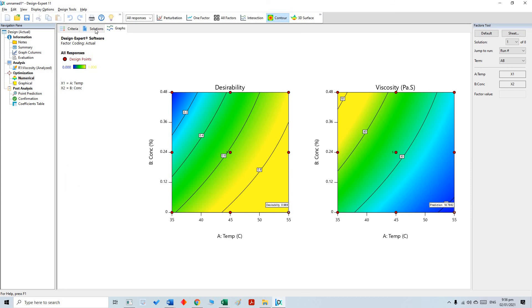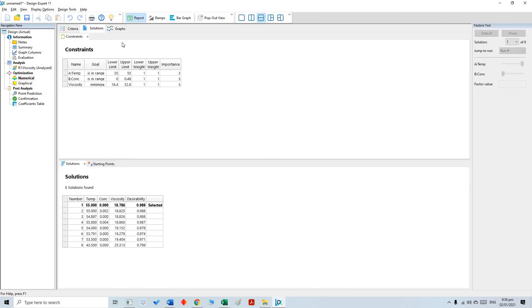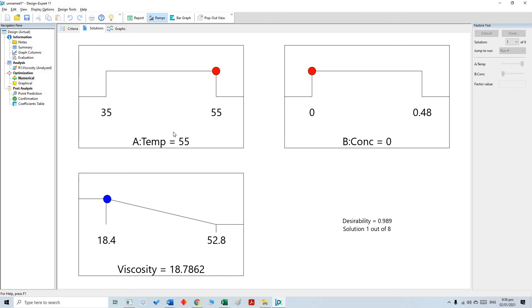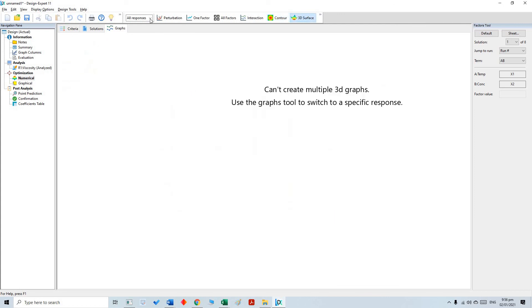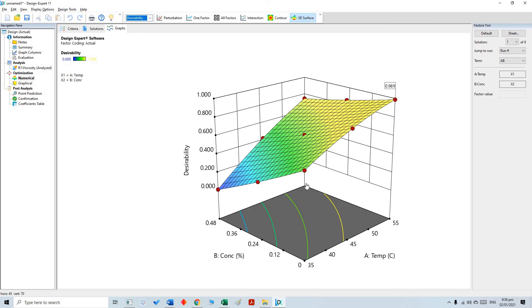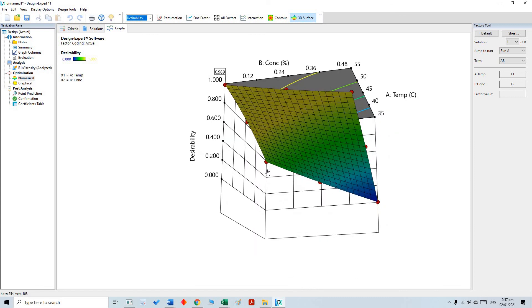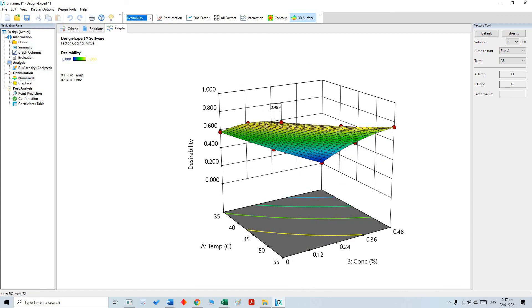The first solution can also be viewed in the ramp function, which is a graphical presentation of the solution showing viscosity minimization. You can see the slope, with both temperature and concentration in range. We can also get a bar graph showing the combined optimization solution. For the 3D surface, we can get the desirability graph, which tells us at what condition the desirability is maximum.